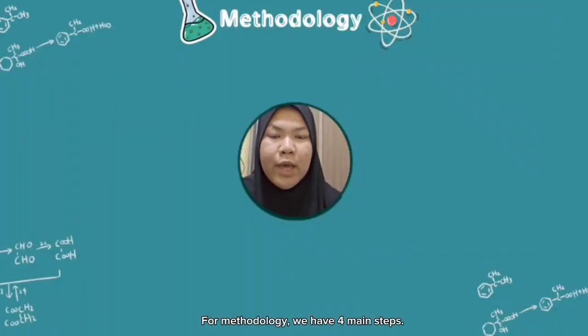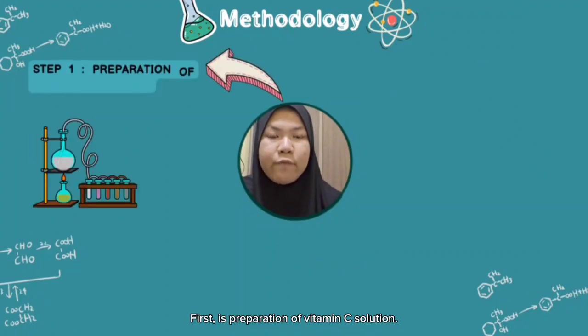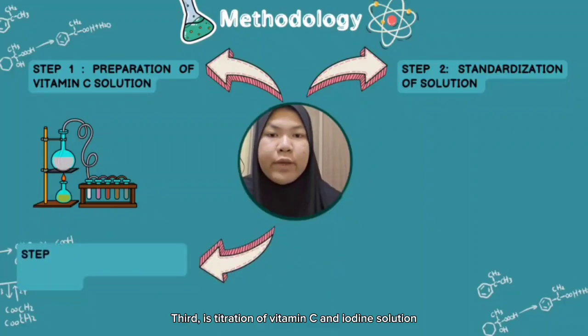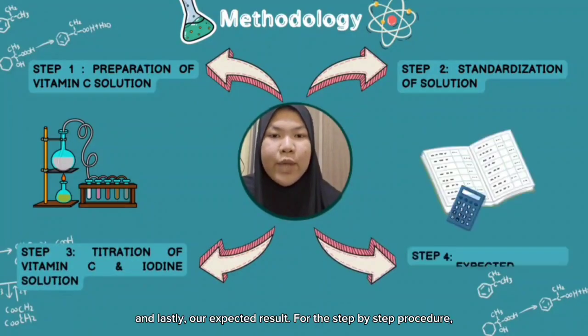For methodology, we have 4 main steps. First is preparation of vitamin C solution. Second is standardization of solution. Third is titration of vitamin C and iodine solution. And lastly, our expected result.